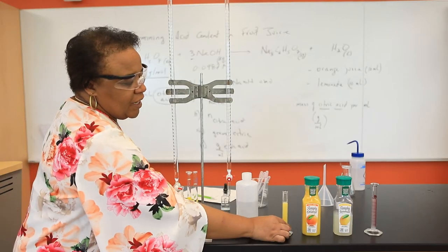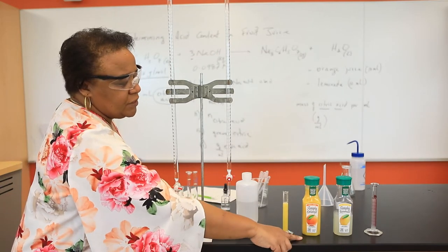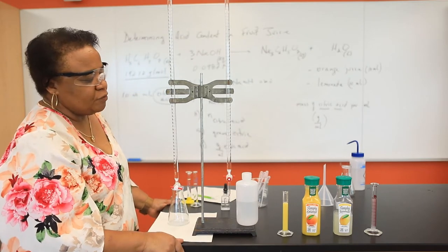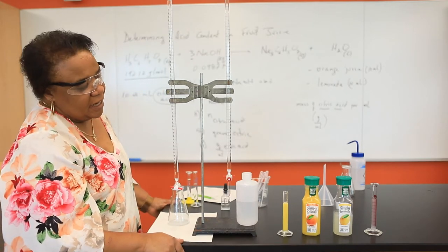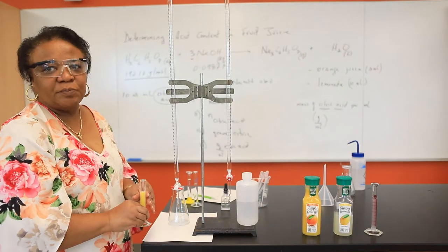In this experiment, we're going to be looking at the acid content in both orange juice as well as lemonade to determine which is the most acidic. We're going to be reporting our answer at the end in grams per mL.